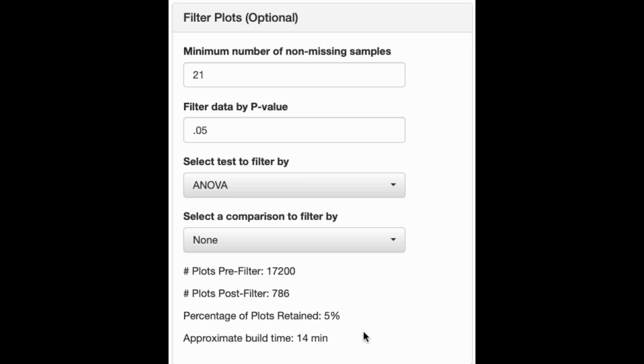If no filters show up, it means that for your specific dataset, there are no valid filtering options. You may skip this step and continue.